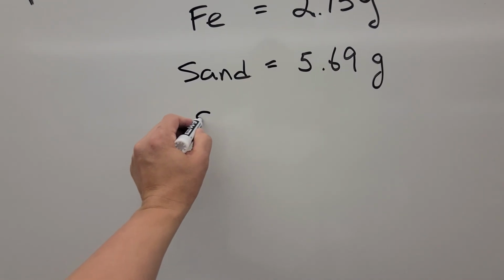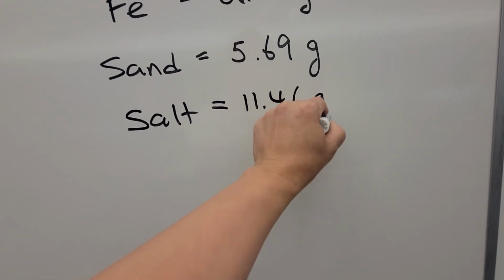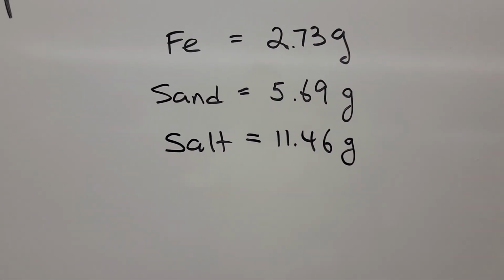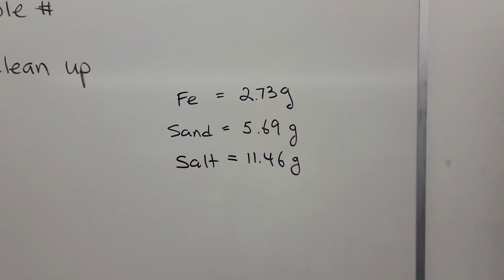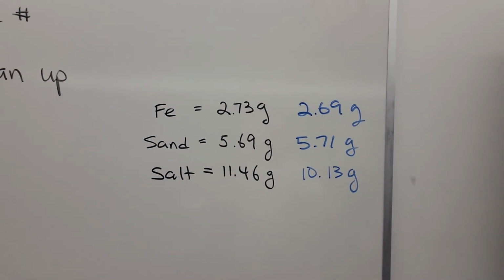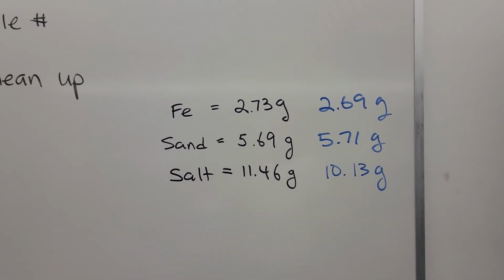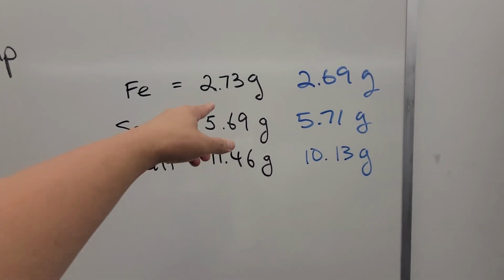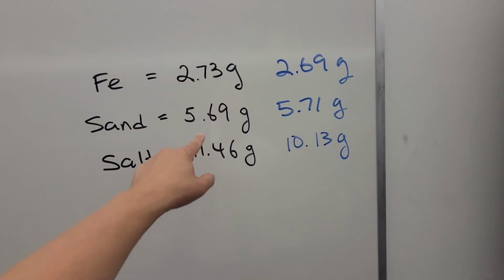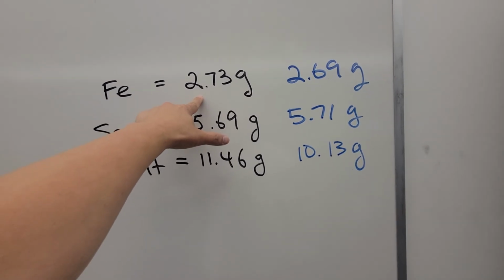What did I just... salt. Well, I know that's wrong because I didn't give anybody that much salt. So that most likely means my salt was not dried. So I looked up on the spreadsheet. These are the amounts actually put in. So we can calculate percent errors. This is very little error. That might be a little bit of positive error balanced out by negative error.